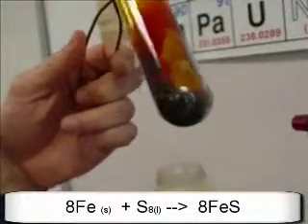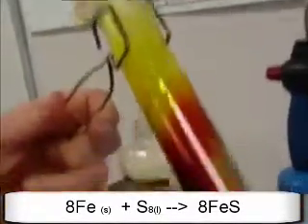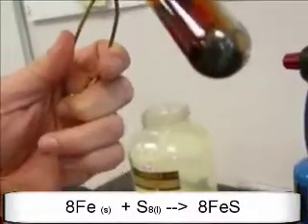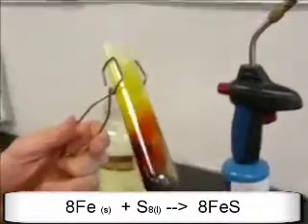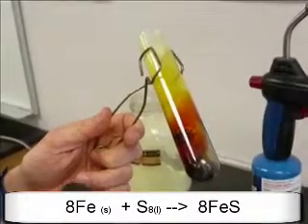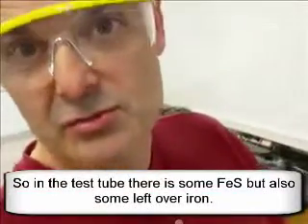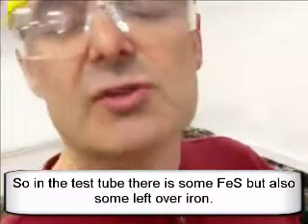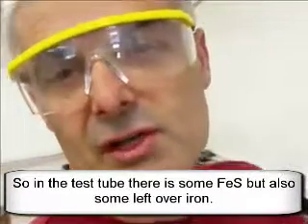If I take the magnet, now that the iron has reacted, it is no longer going to be attracted to the magnet. As you can see, there's some that's attracted to the magnet. I probably didn't put enough sulfur in the reaction. If it totally reacted, it would not be attracted to the magnet at all, because I think I put too much iron in there. You'd have to figure out how much you'd want to add. But let's assume that I did. It would be unattracted to the magnet, which means you have produced something else, in this case iron sulfide, as opposed to just iron and sulfur.